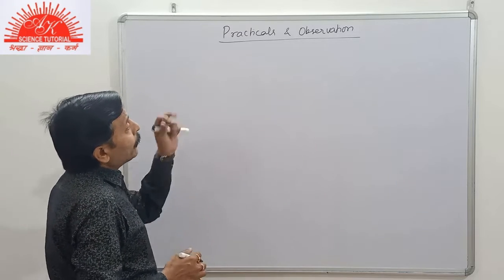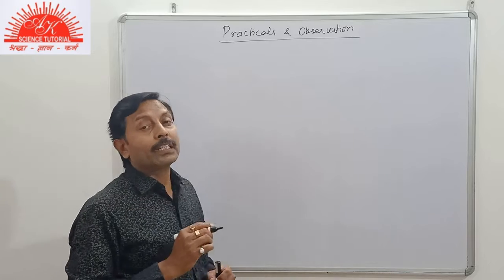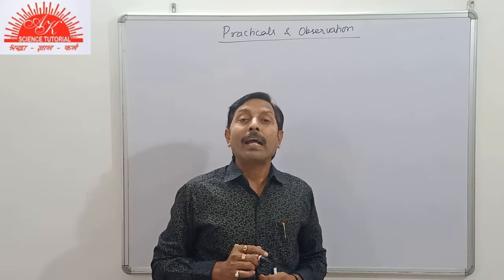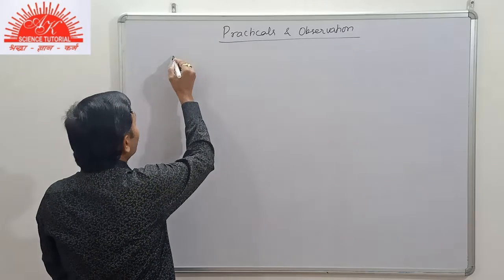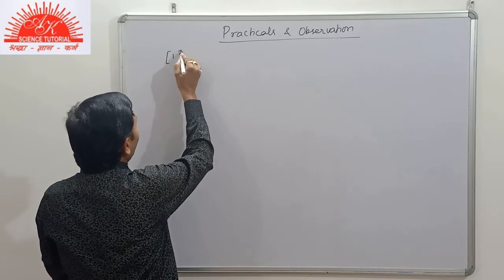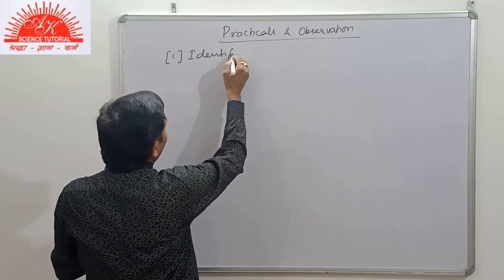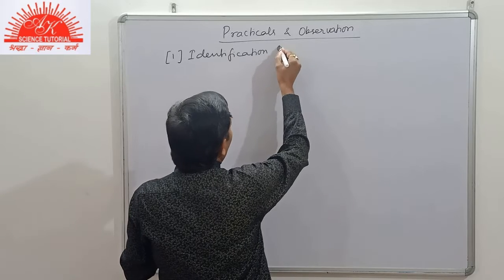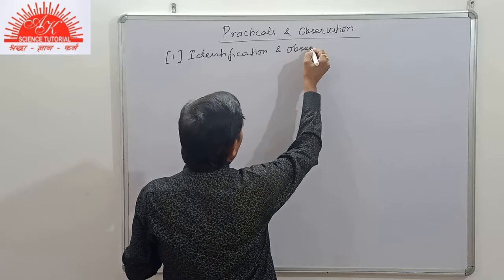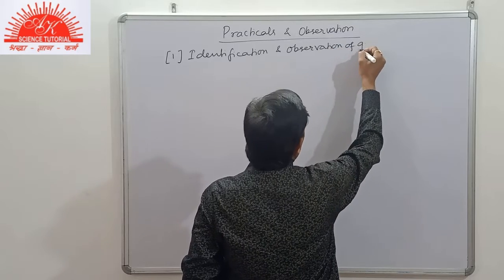So, in the first part of it, I am going to start with the identification and observation of gas.